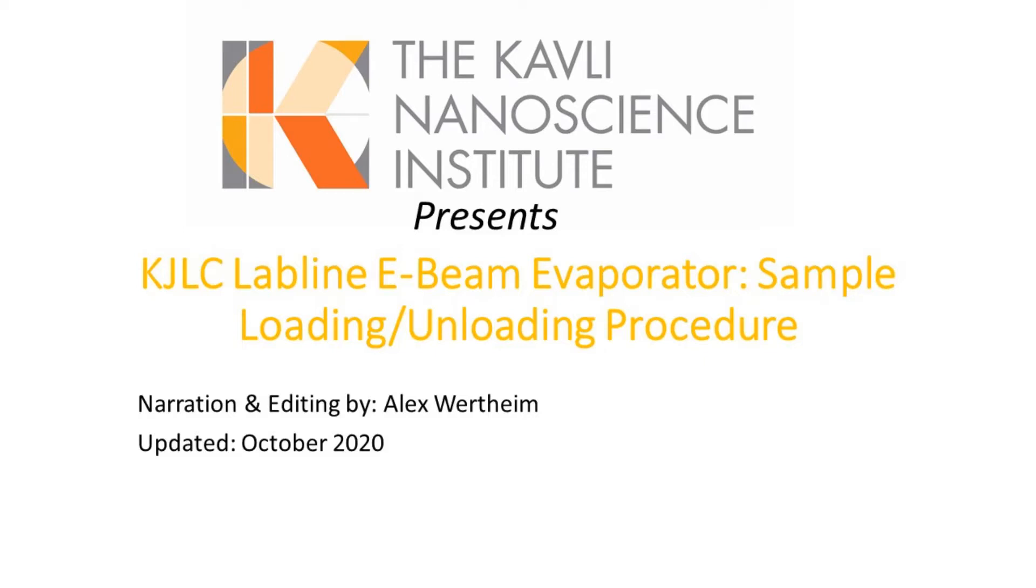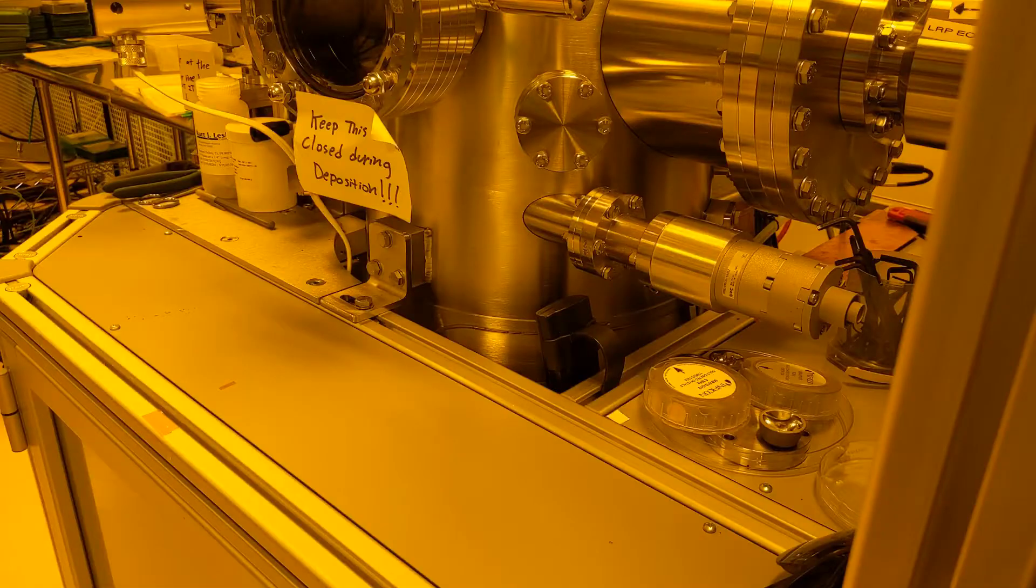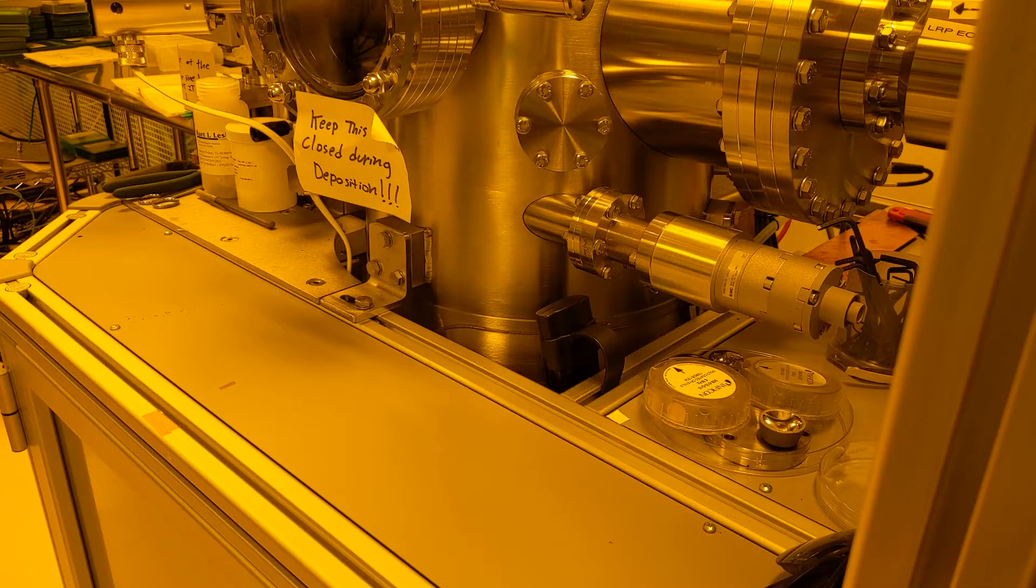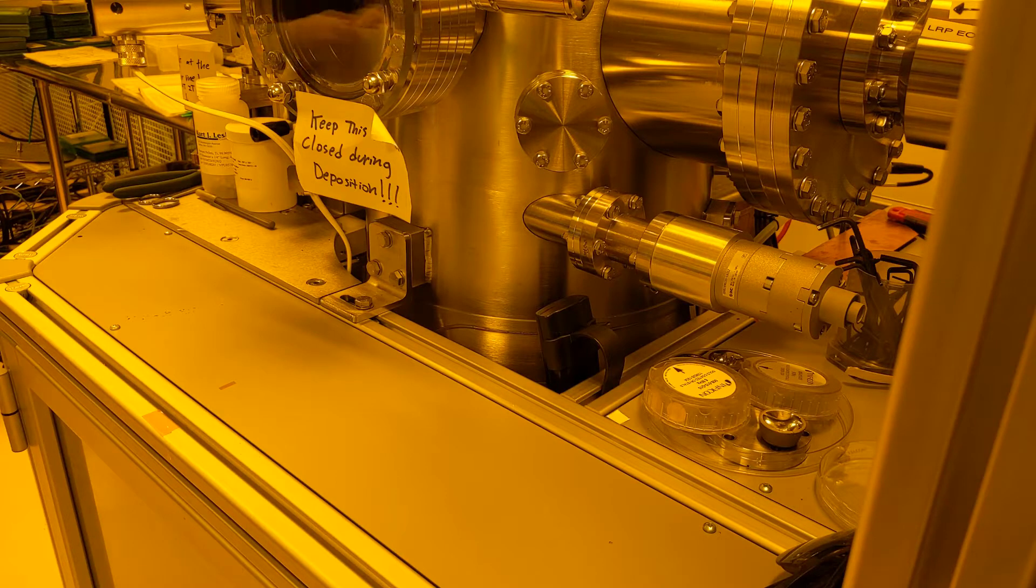This video is for our lab line series electron beam evaporation chamber. Here I'm going to show you the sample loading and transfer procedure. First we'll load and transfer our sample into the chamber.